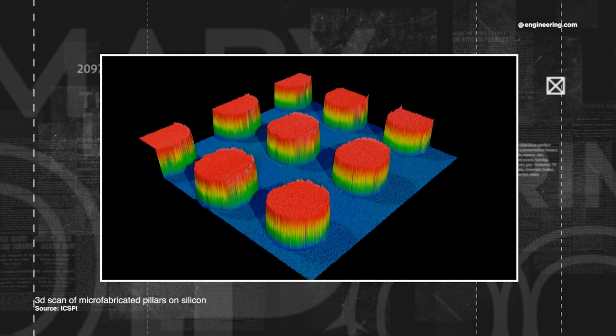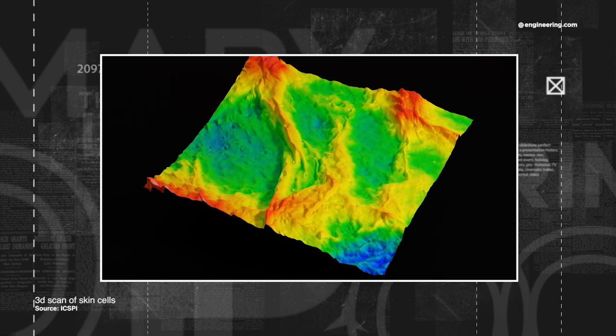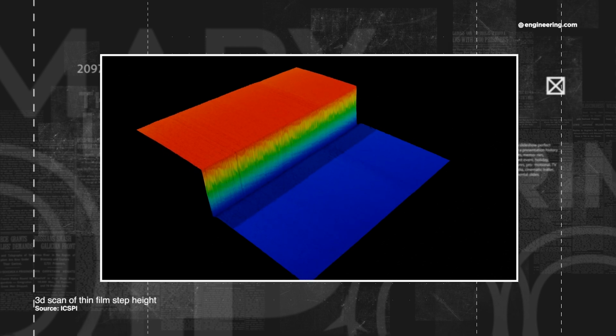In our case, for our systems that use our MEMS technology, we're at about 0.5 nanometer down to about 0.1 nanometer. So we can look at, say, the step heights of a lattice for a ceramic like silicon carbide.